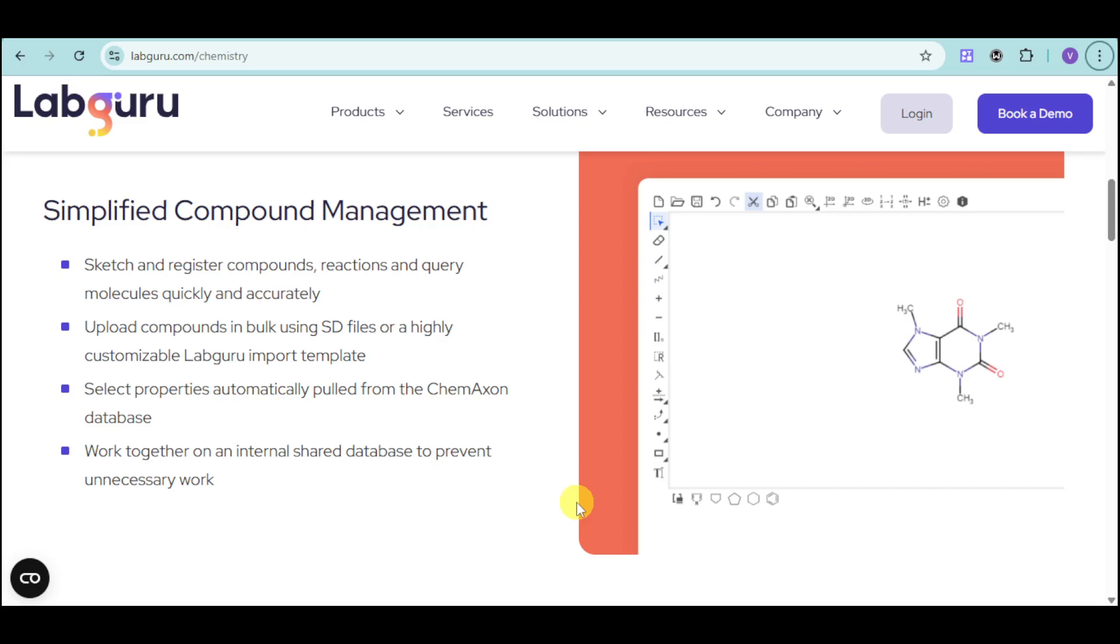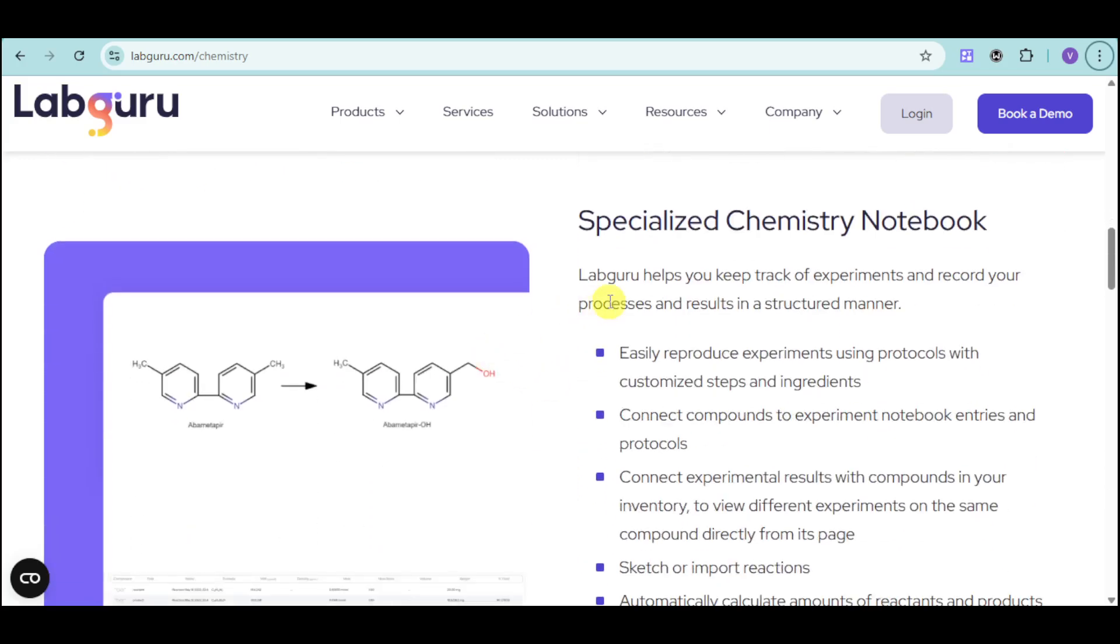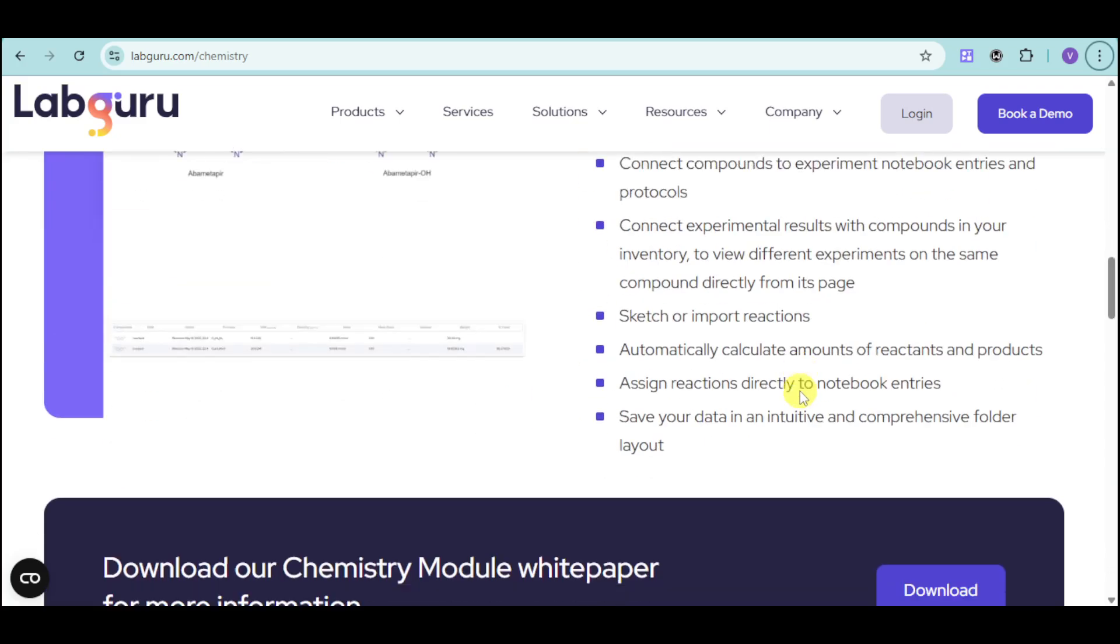LabGuru also has a chemistry notebook that can help you with your simplified compound management. You can sketch and register compounds, reactions, and query molecules quickly and accurately. You can also upload compounds in bulk using SD files or LabGuru import template. You will also have a specialized chemistry notebook aside from the simple one.